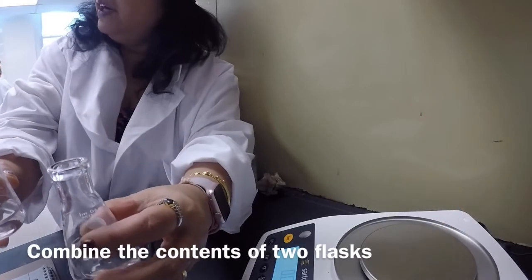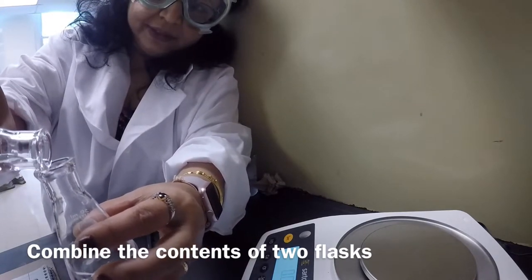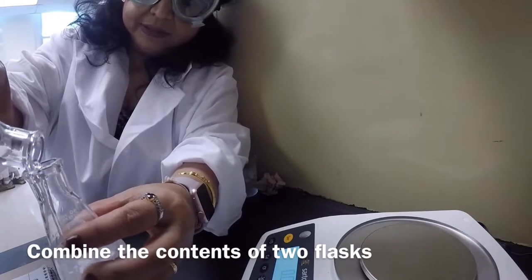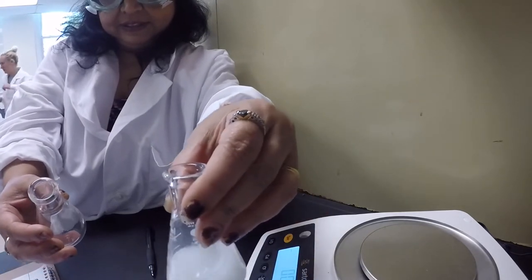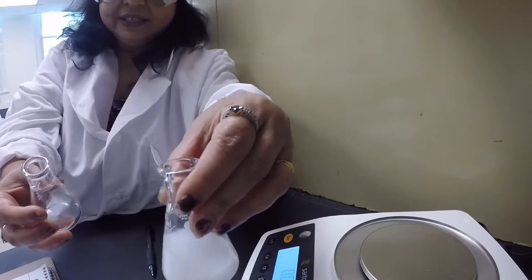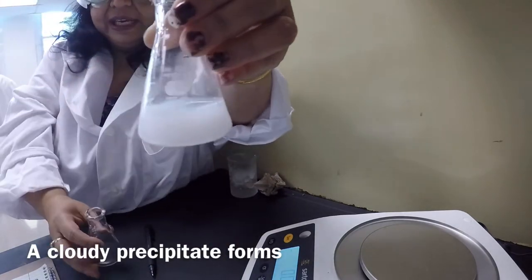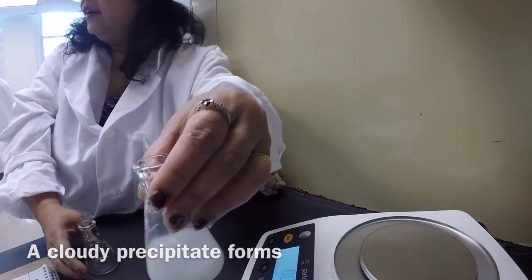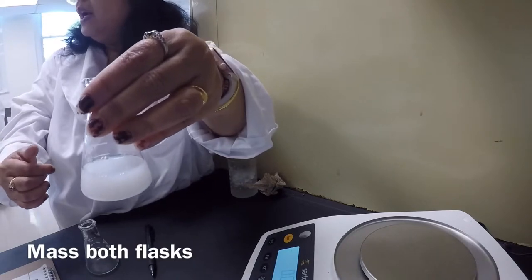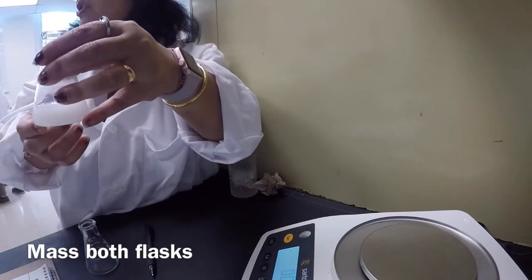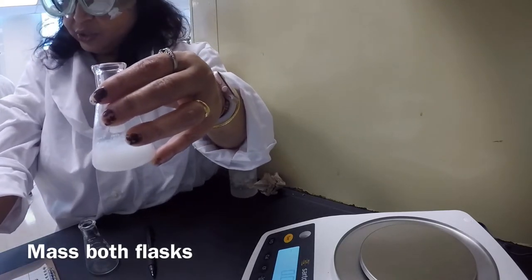So be very careful and start pouring one in the other. Just swirl a little bit, and we got something totally cloudy white in color. Okay, and what I'm going to do now is mass this flask with this solution and see if it weighs the same.